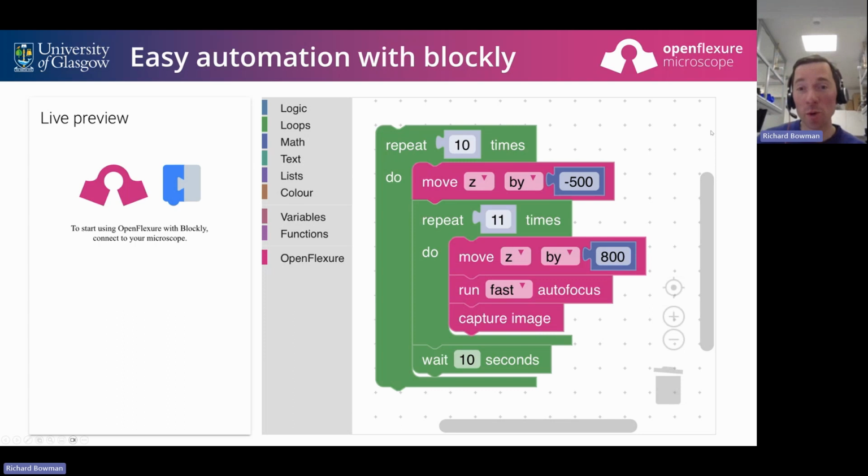There's also a voice control module for the curious, implemented by the same guy who put this together. I don't think we've used that in anger yet, but it was quite fun to demonstrate that it's possible. And of course, you can have that as a client running somewhere in addition to whatever other interface you're using.